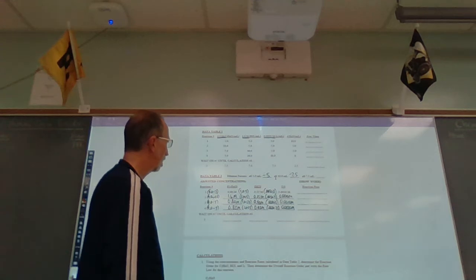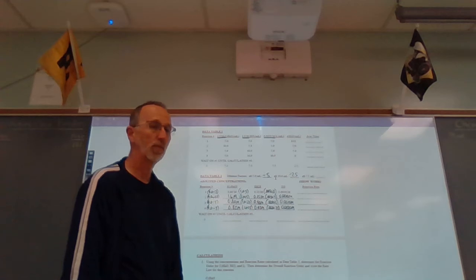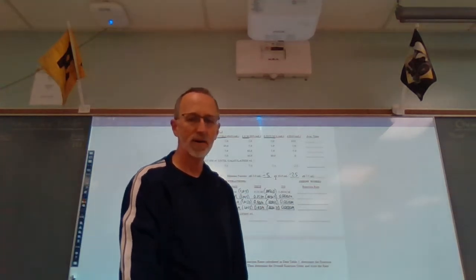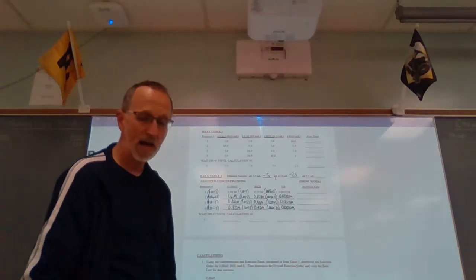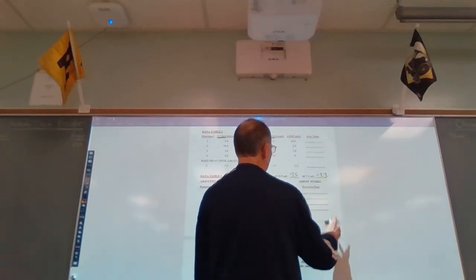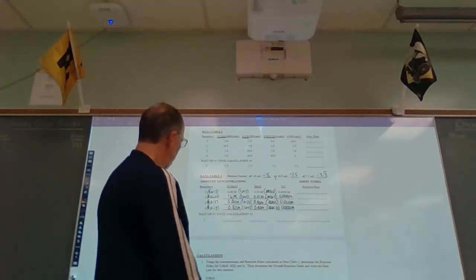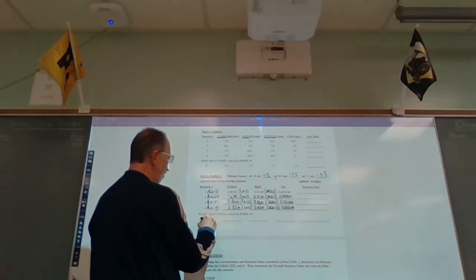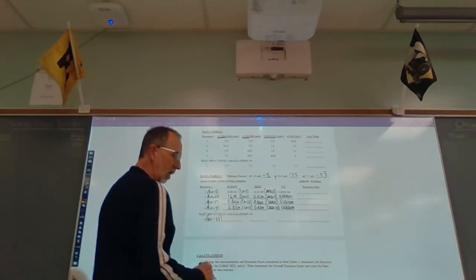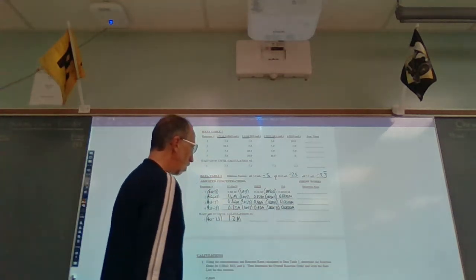The last one, number 5, we have 7.5 mLs originally of actually all 3 of these. And if you take 25 divided by 7.5, you get 3.3 repeating. So our dilution factor for all the 7.5 mL ones is 3.3 repeating. So if we take the original concentration of acetone, 4.0, divided by 3.3 repeating, gives us an adjusted concentration of 1.2 molar.